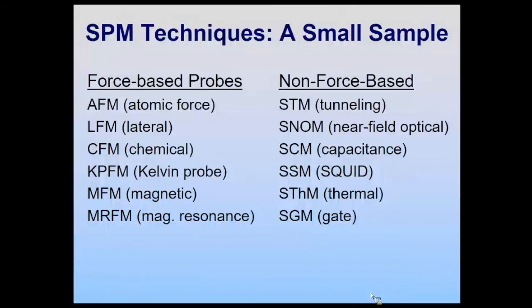There are also non-force-based techniques. The one I'm going to focus on is STM, tunneling microscopy, but there's also optical techniques, so SNOM or NSOM, scanning capacitance, SQUID, thermal gate, and so on and so forth. So lots of different things that you can measure with scanning probe microscopes.